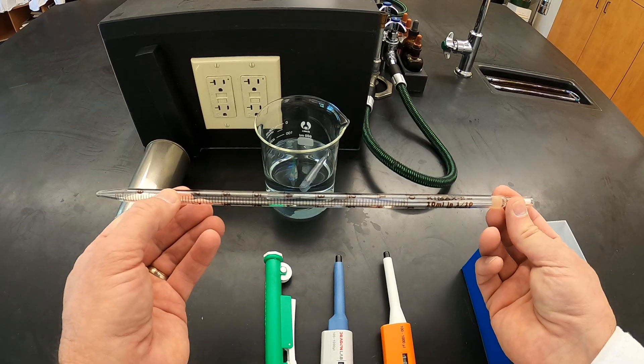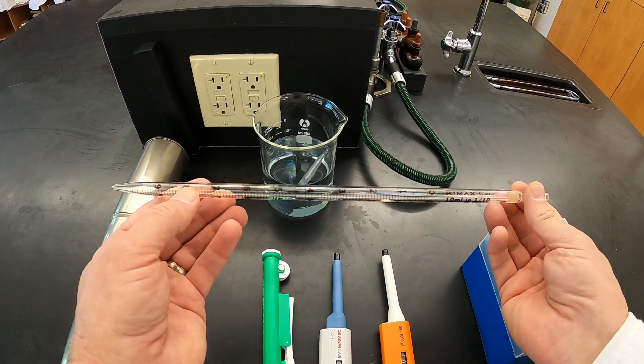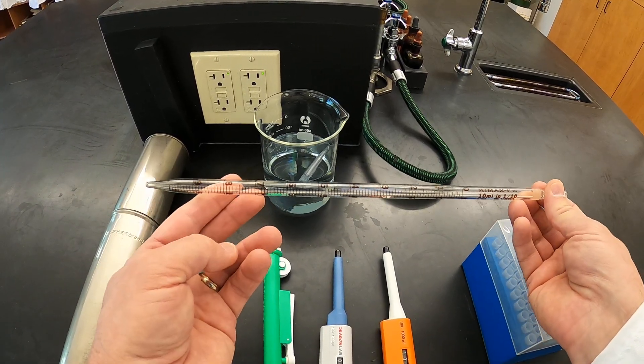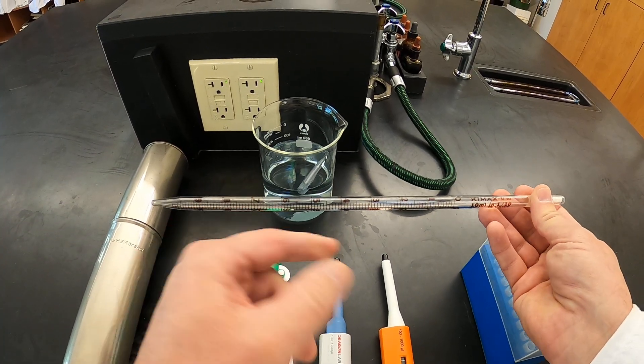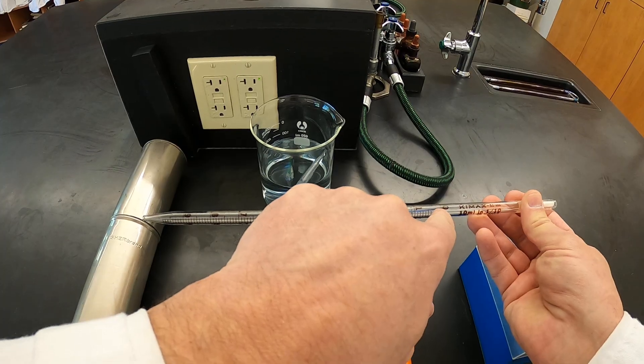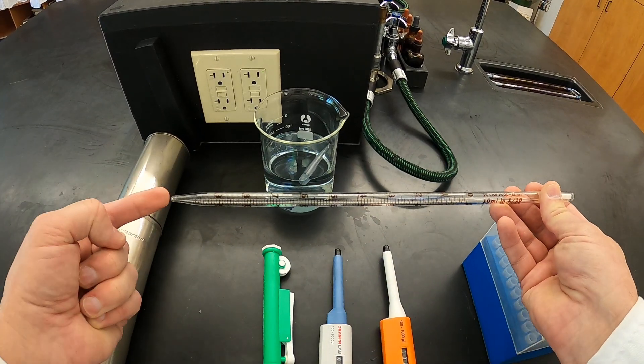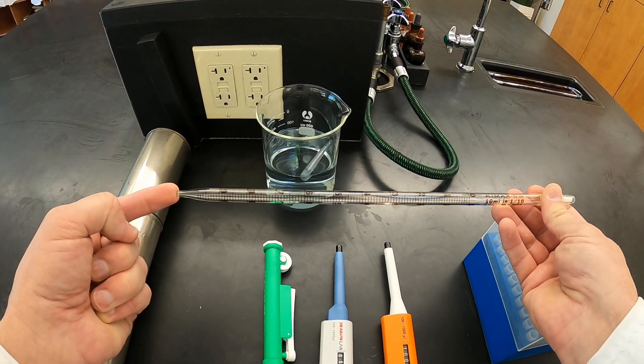This again is because of the etched band, and we look at the markings on here we can see this is a serological or a blowout pipette, and the increments here go from zero milliliters all the way to 10 milliliters at the very end.